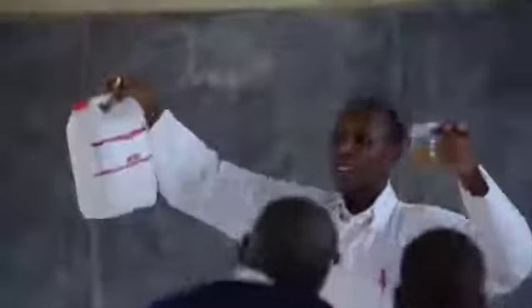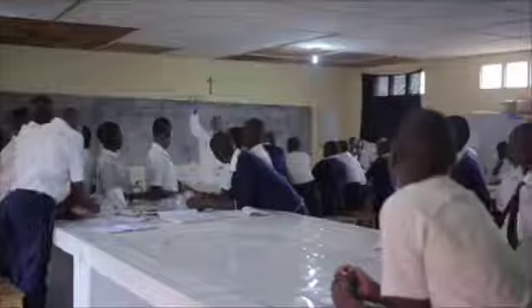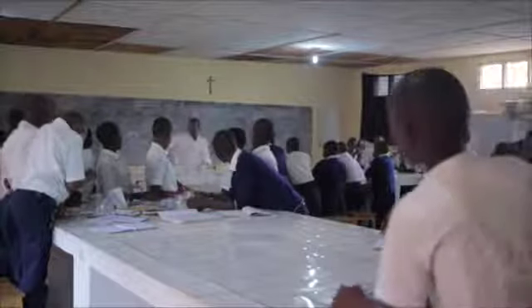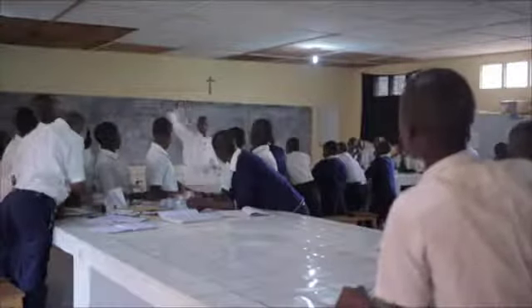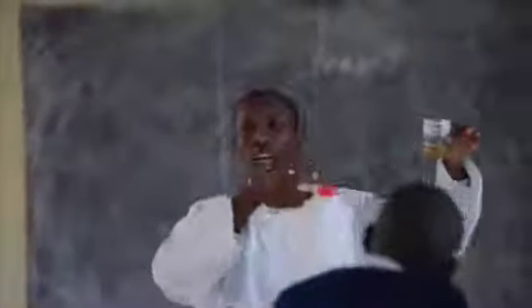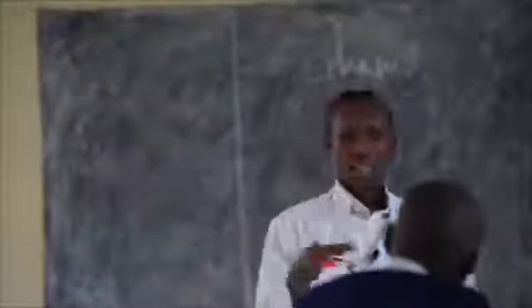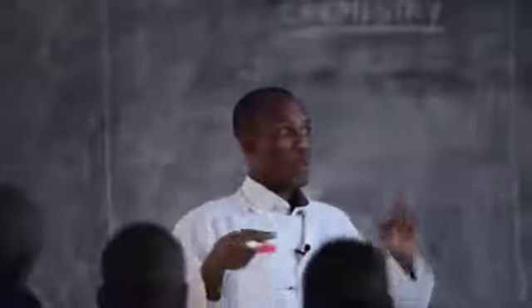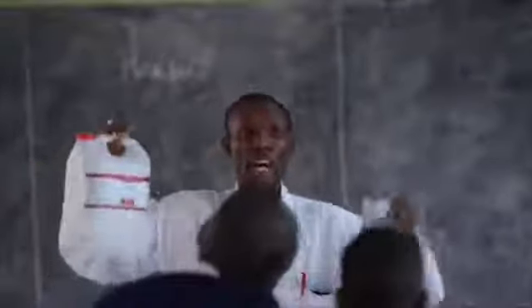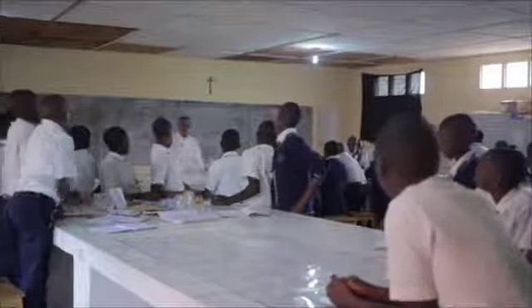I have tried to separate or to remove ethanol from this banana beer. After separating ethanol from the other components, I have ethanol, which is pure. In the next week, we are going to see how to separate ethanol from other substances from banana beer or this alcohol which we have.